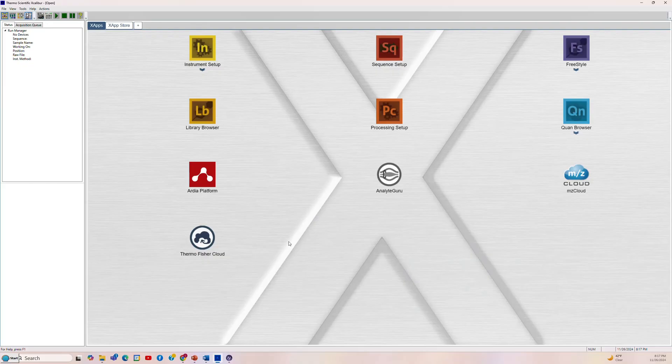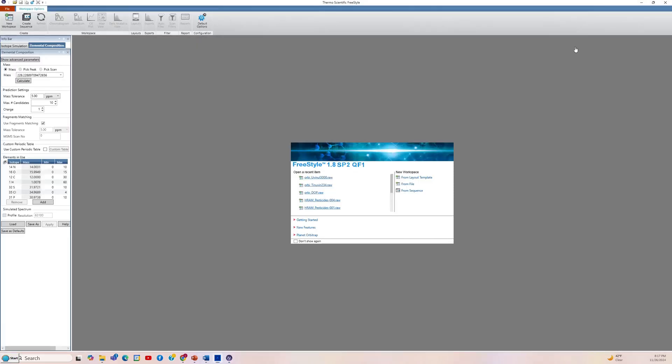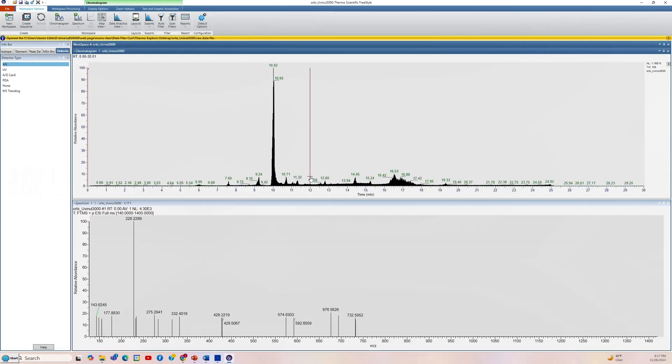So now let's go to the software. We'll first go to the Xcalibur suite of applications and open Freestyle. Then open the Orbi Uvinul 3000 data file. And what comes up is the total ion chromatogram, which includes the positive and negative ions and the MS and the MS-MS. So we need to parse this out to find the different parts of the data that we need for the analysis.